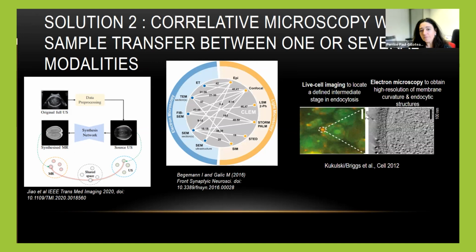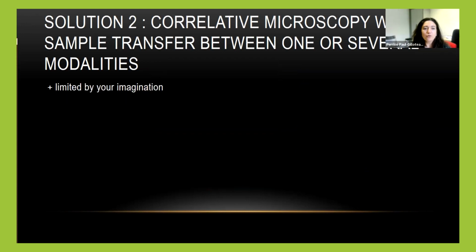That's really the kind of microscopy, the cryo one, which has been pushing correlative microscopies and developing a lot of approaches for that, with, for example, pioneering work from Wanda Kukulski and John Briggs and different people at the EMBL as well, on imaging live samples and deciphering some mechanisms of cluster formation, for example. So the good thing is that it's basically just limited by your imagination about what you can combine together. And the bad thing is that there are a few technical details to be certain. It's not that easy, actually.